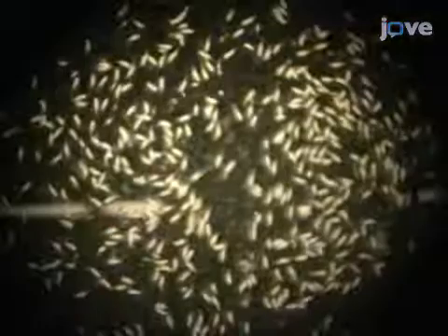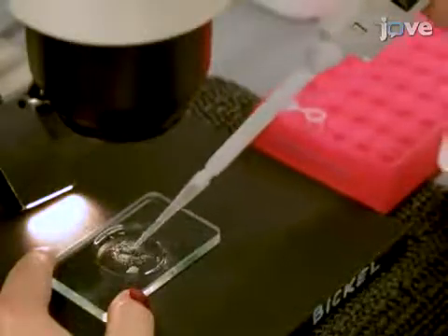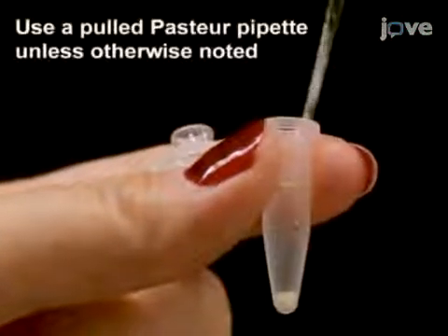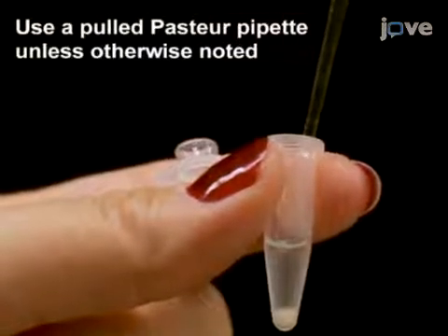When late-stage oocytes are sufficiently separated, transfer all the tissue to a 500 µL microfuge tube. Remove excess liquid with a pulled Pasteur pipette, leaving about 150 to 200 µL in the tube.